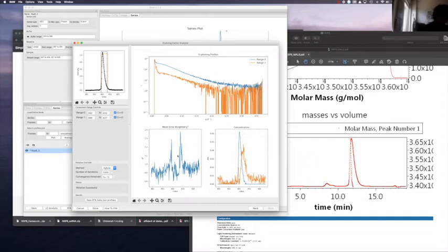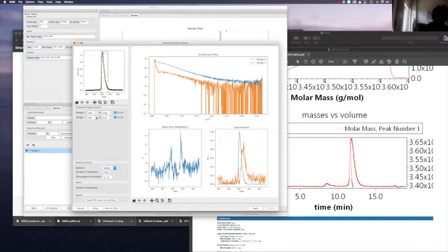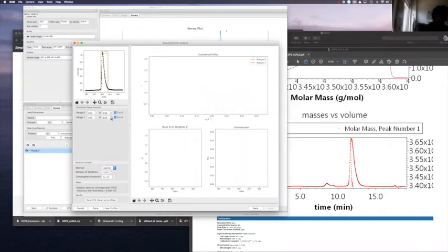Based on chi-square, we will kind of believe yes, but if you really want to minimize the chi-square fit of these two curves to the entire dataset, you will realize you will not be able to separate those. So you see, it's almost impossible.